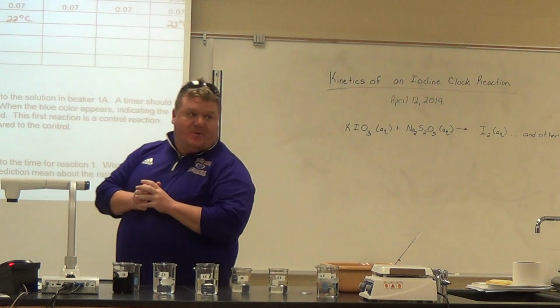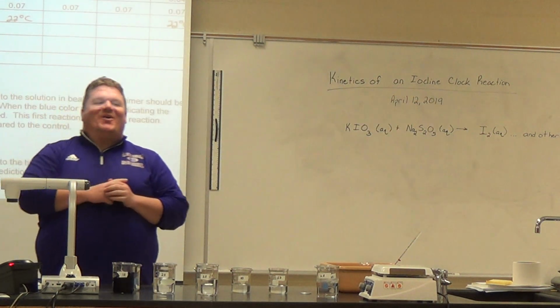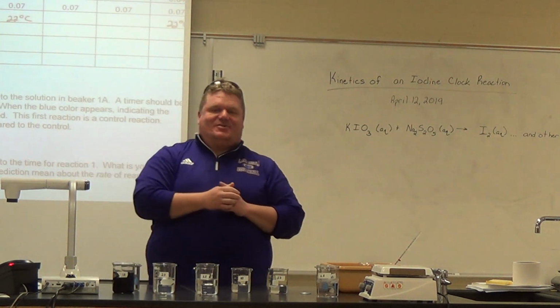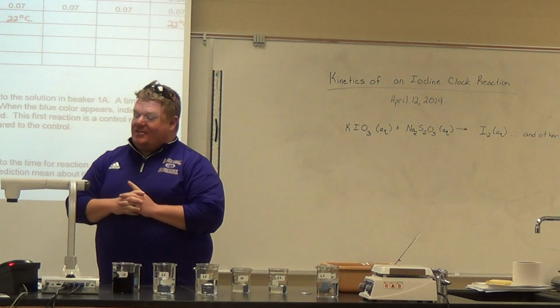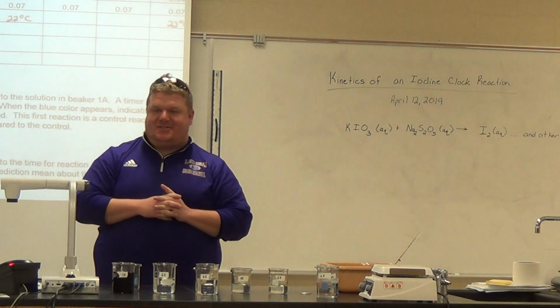Would anyone like to share their prediction with us? 5.1 seconds. I wasn't looking for an actual time. Why do you say it's going to be less time, sir? Because I'm assuming you're going to have a catalyst and that'll make it react faster. There is no catalyst in this one. Anyone else?